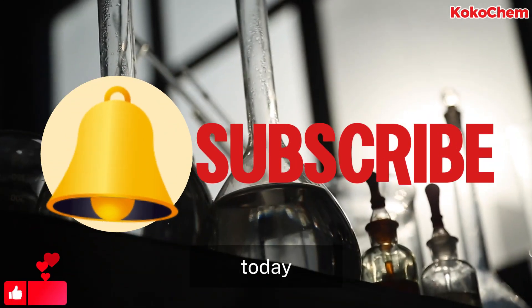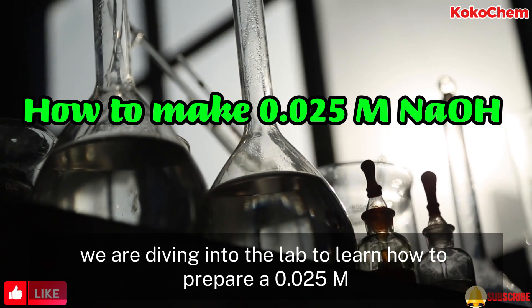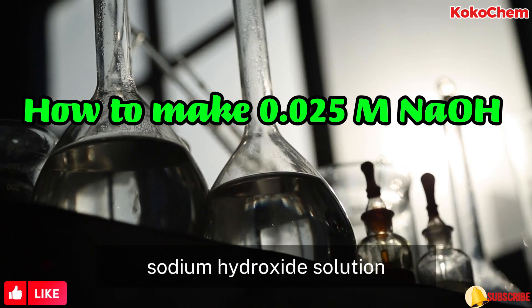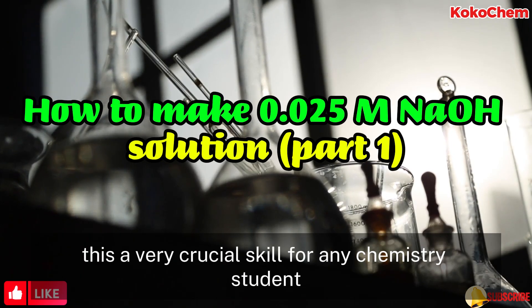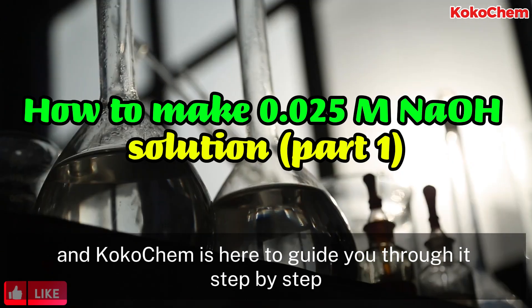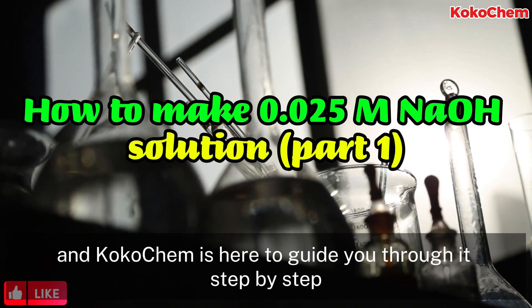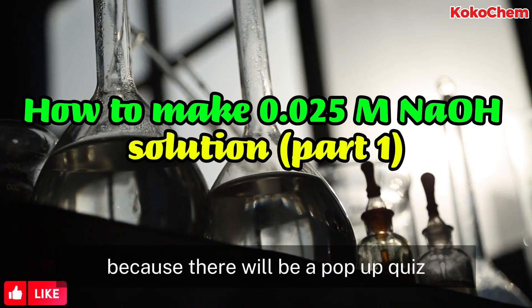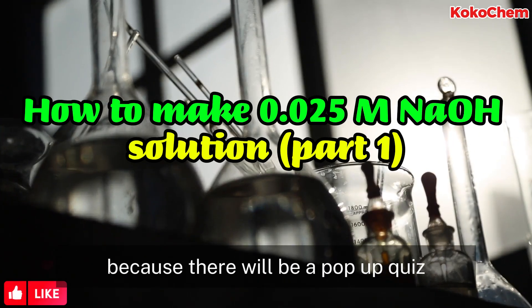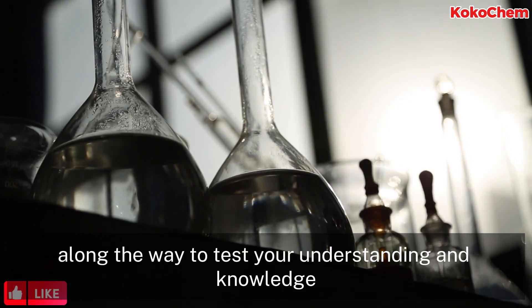Hello future chemists. Today we are diving into the lab to learn how to prepare a 0.025 molar sodium hydroxide solution. This is a very crucial skill for any chemistry student, and Coco Chem is here to guide you through it step by step. Make sure you are paying attention because there will be a pop-up quiz along the way to test your understanding and knowledge.